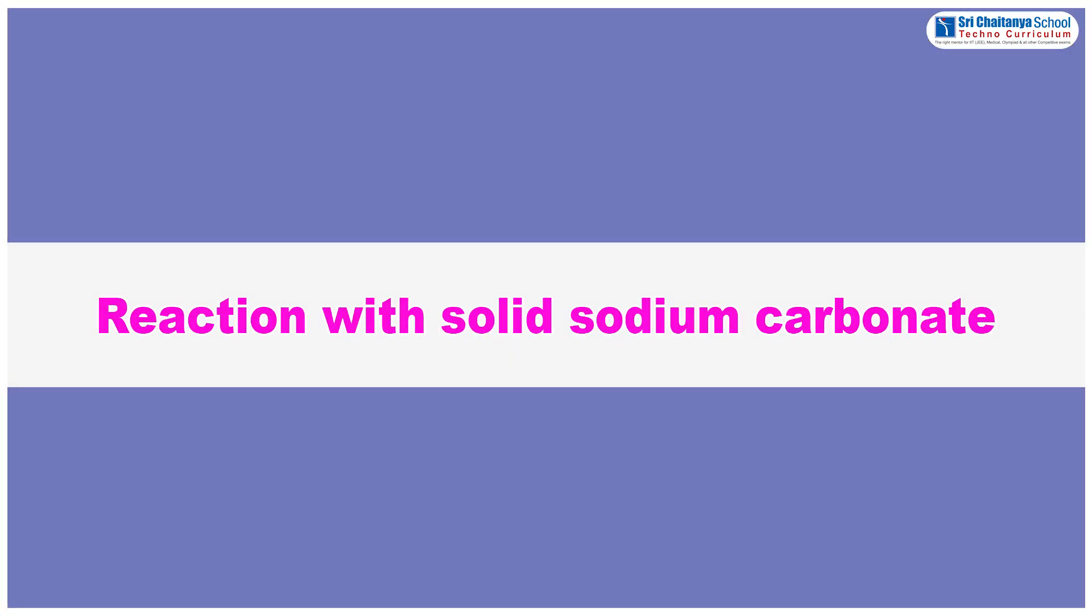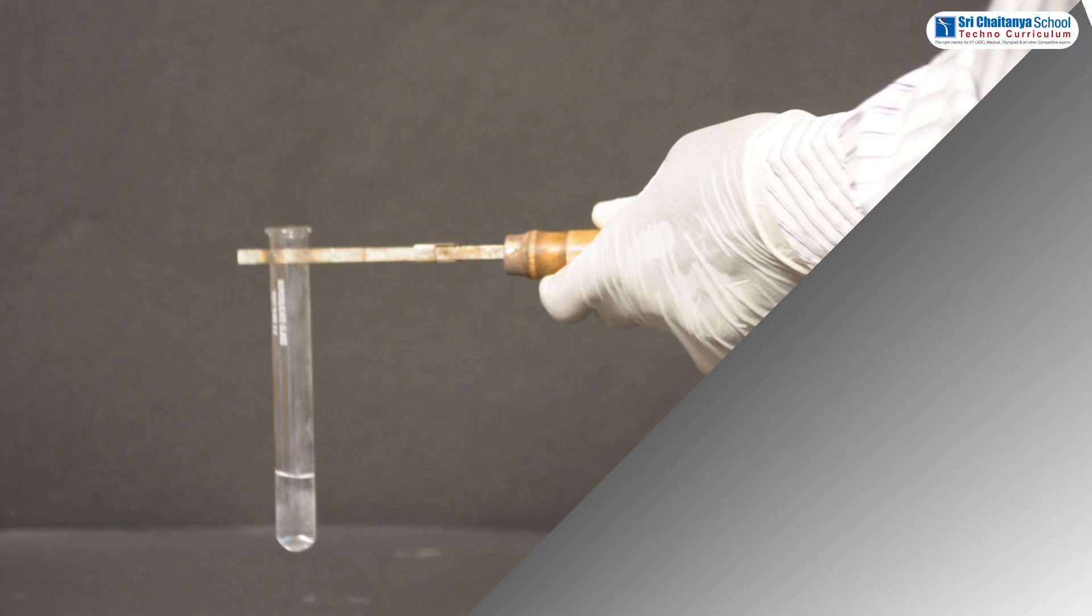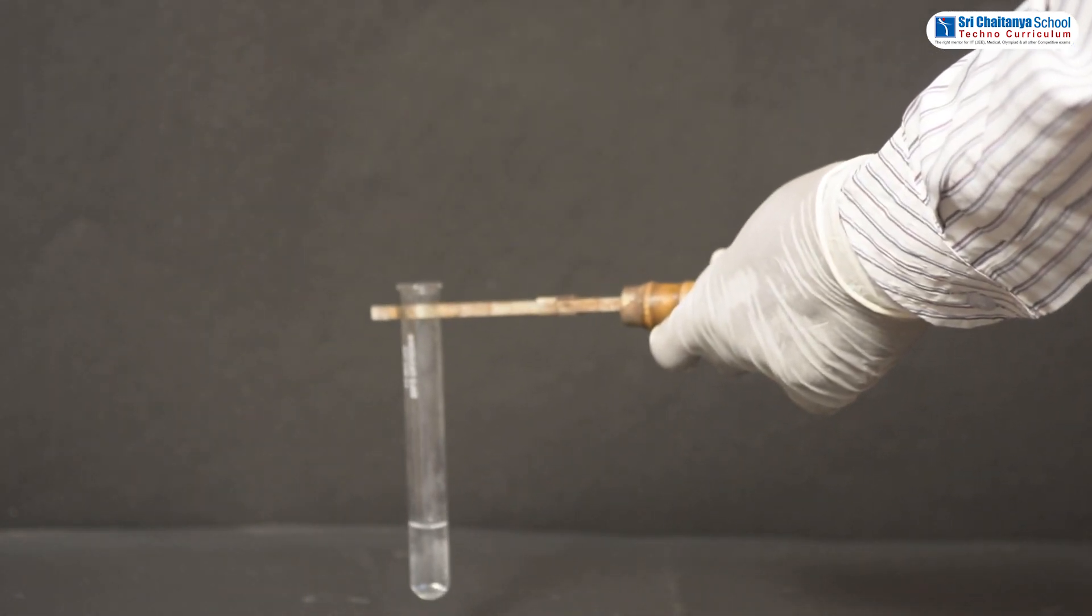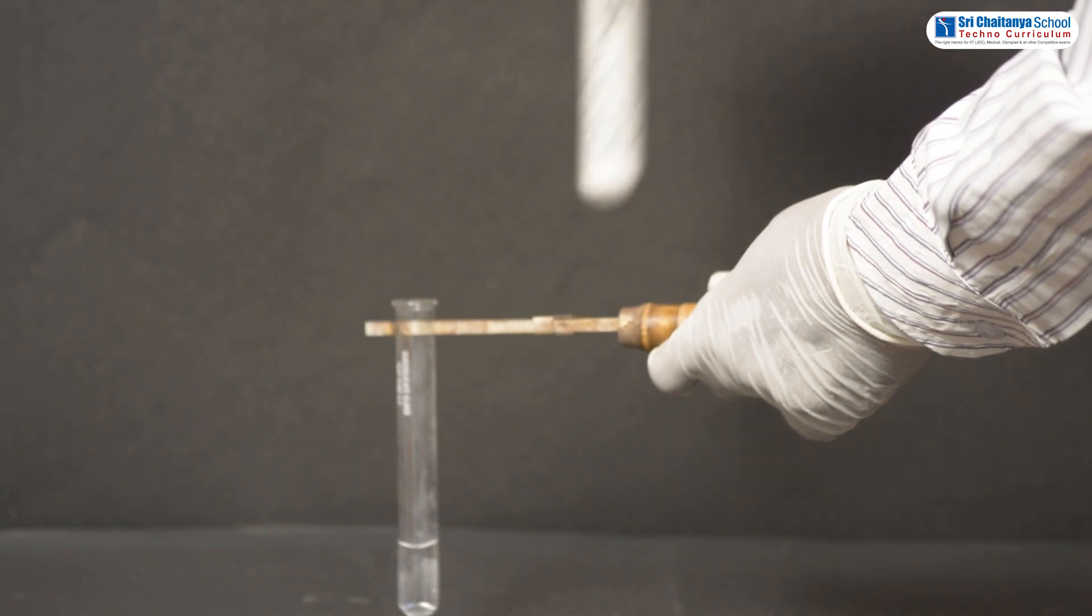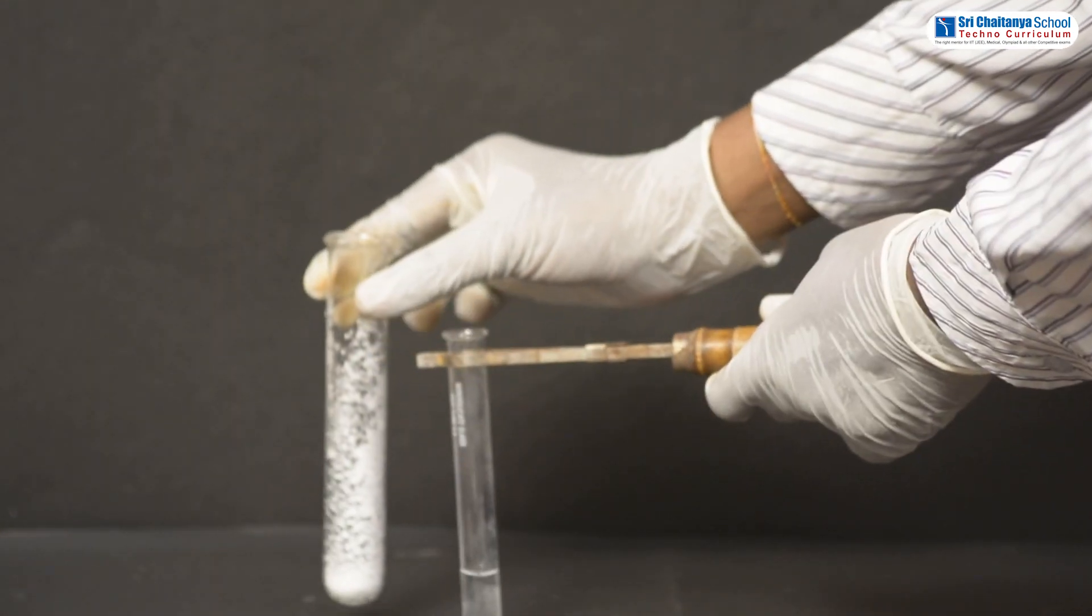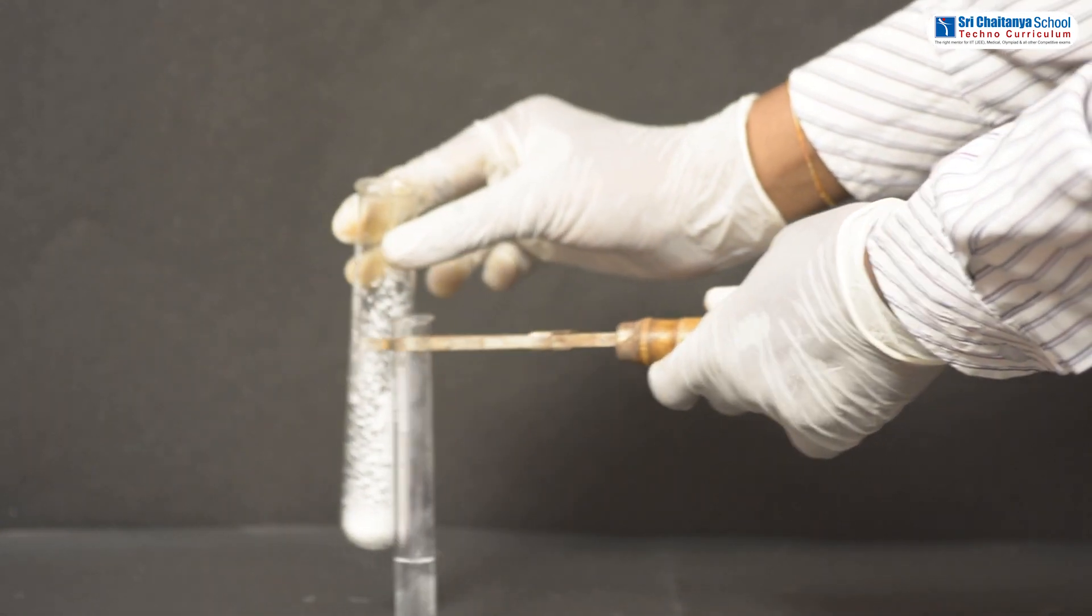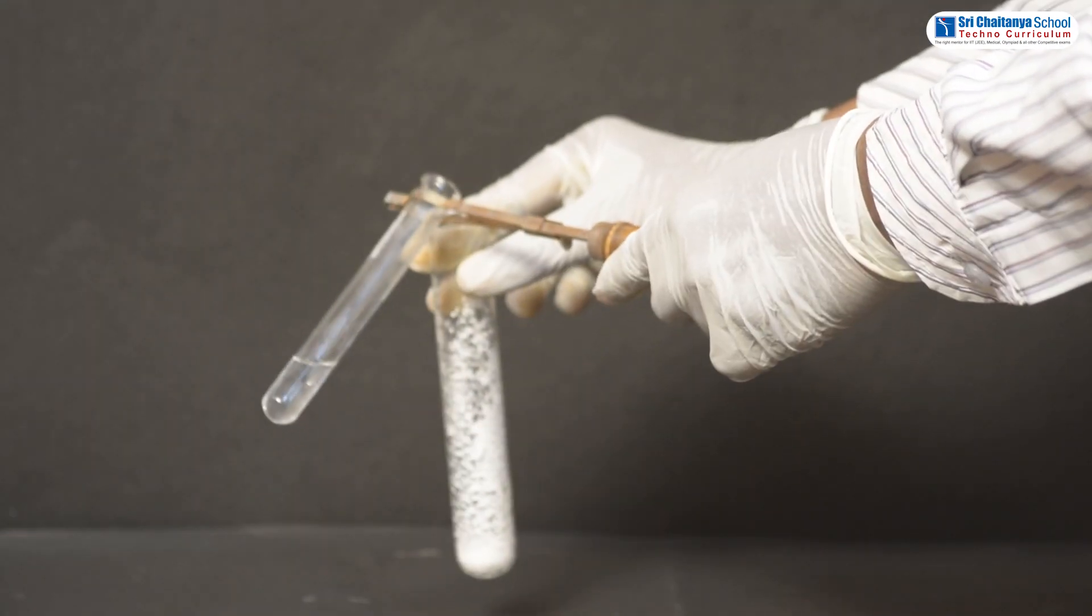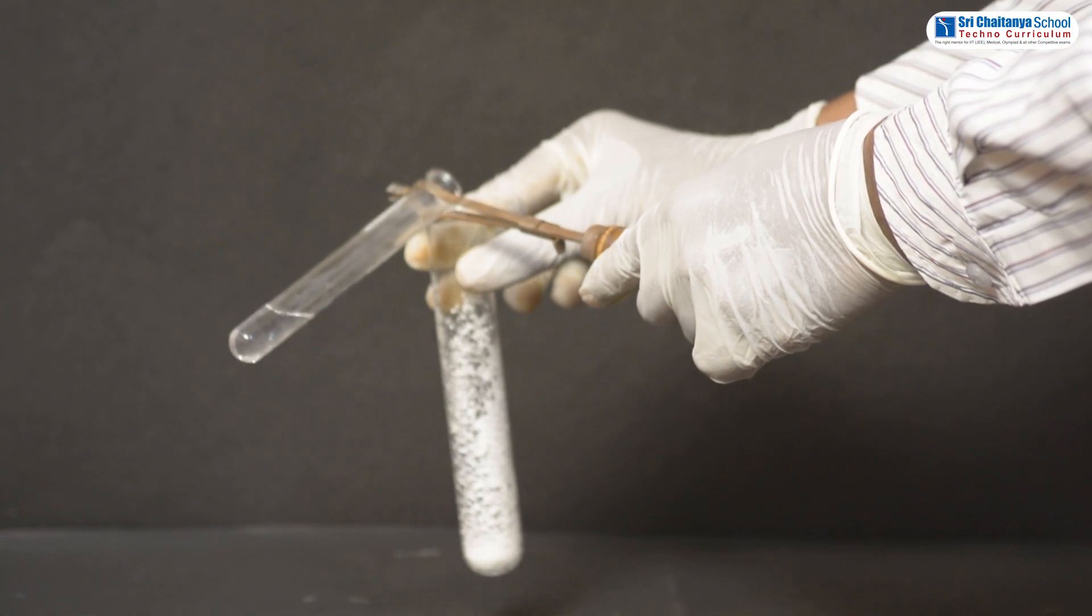Reaction with solid sodium carbonate: Take 2 ml of solution of NaOH in a test tube and solid sodium carbonate. Add NaOH solution into carbonate.